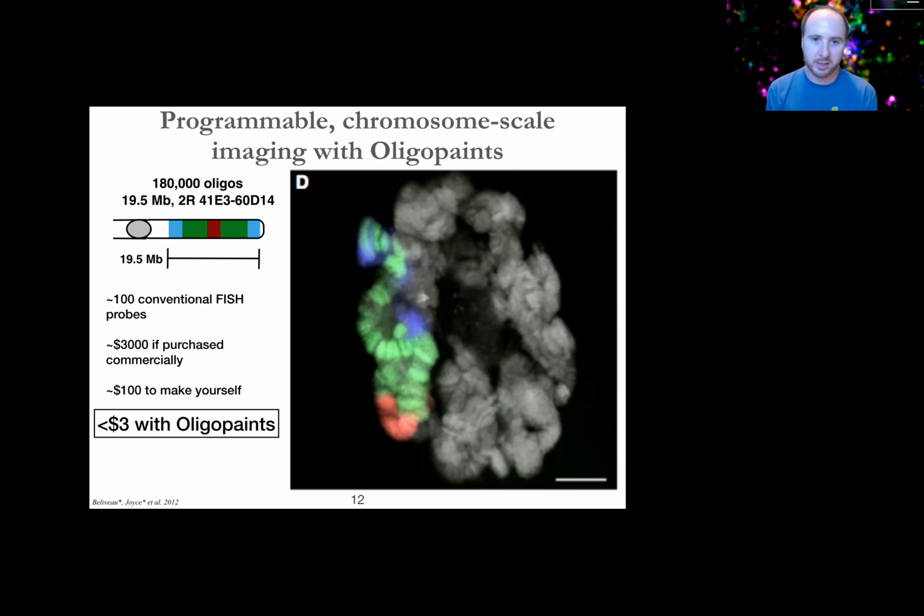And yeah, I think the other really nice thing is that the scaling works not just in terms of the cost effectiveness of the molecular biology once you get going with it, but also just in terms of the general protocols. So the FISH protocol we used here is essentially identical to the FISH protocol I showed you on the previous slide, targeting small and big regions. It's pretty much all the same. You'll have to tweak it, of course, for tissue sections and things like that. They may have nuances, but when you're working in a given system, the complexity of the library doesn't really seem to alter too much how you have to think about the experiment. So I think that makes it pretty straightforward for investigating a lot of different types of questions.